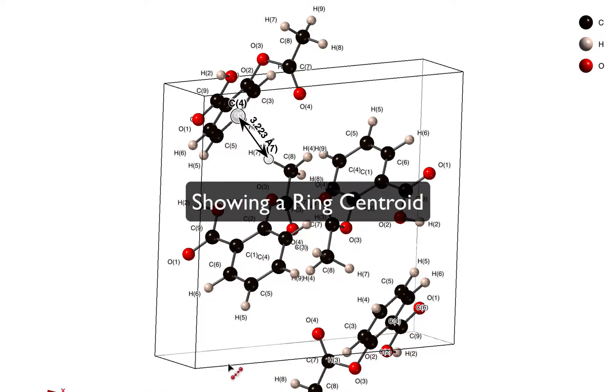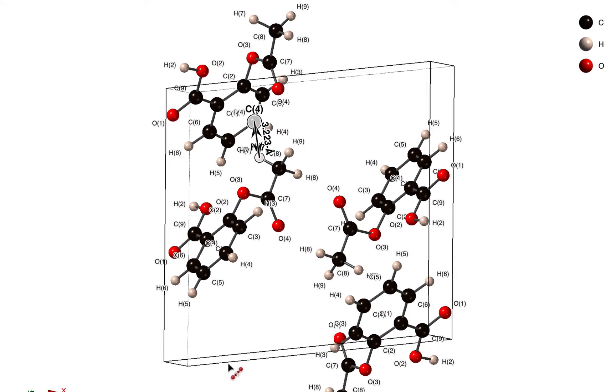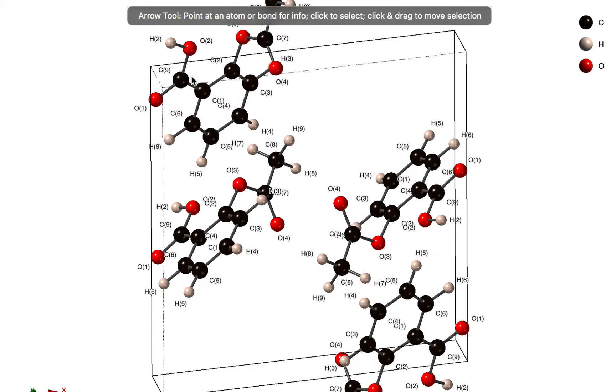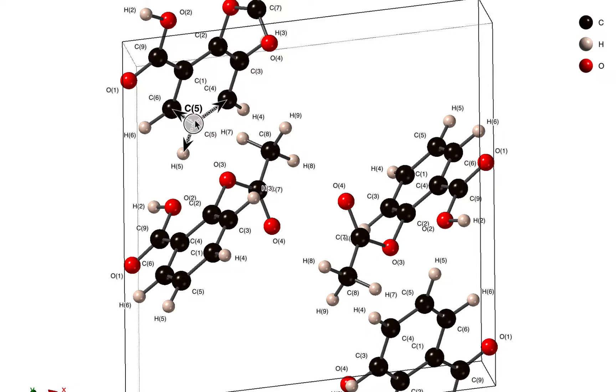Now let's suppose that we're not interested in distances from this hydrogen atom and individual carbon atoms. Maybe we want to measure the distance between this hydrogen atom and the center of this ring. How do we do that?